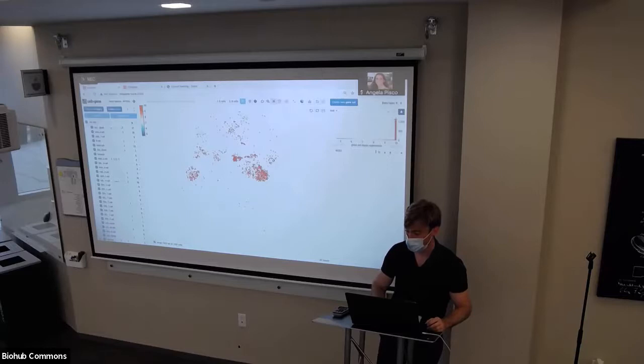And so you have like a huge inflation at 10. And because of that, it kind of skews these histograms, first of all. Second of all, you can use this overall histogram to see what are the ultimate bounds. It goes from around 4.5 to 10. And so here, this is also 4.5 to 10, I think.